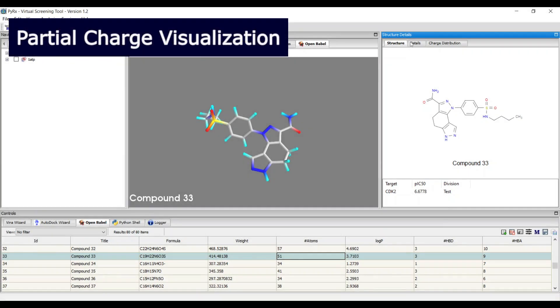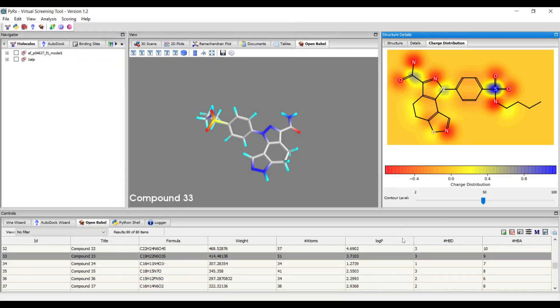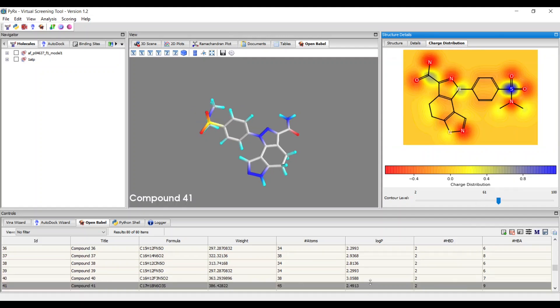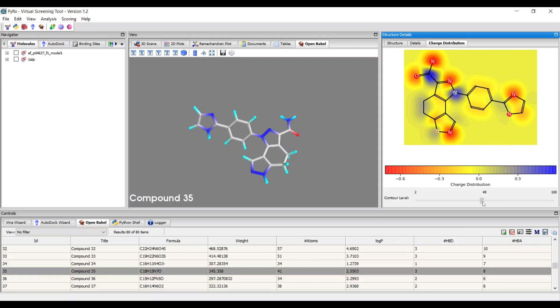You can now visualize ligand partial charge distribution in the Structure Details panel, which provides improved ligand structure analysis and understanding. You can control the contour level of partial charge visualization.